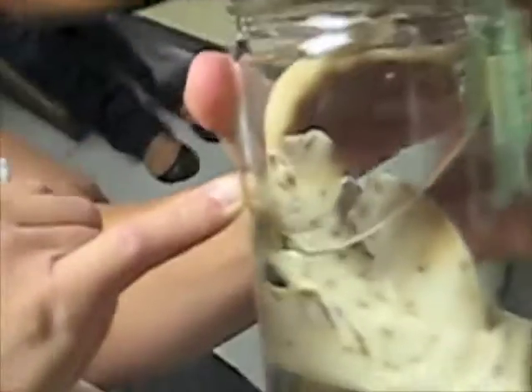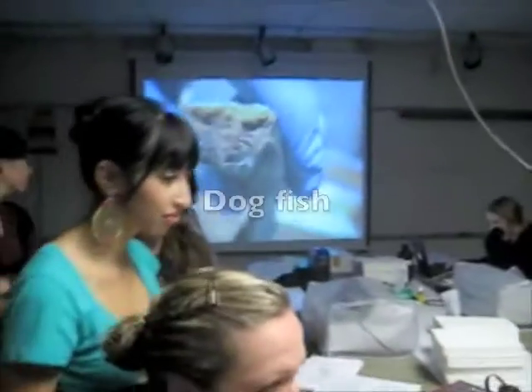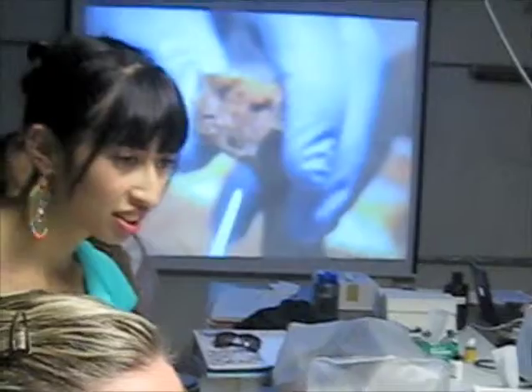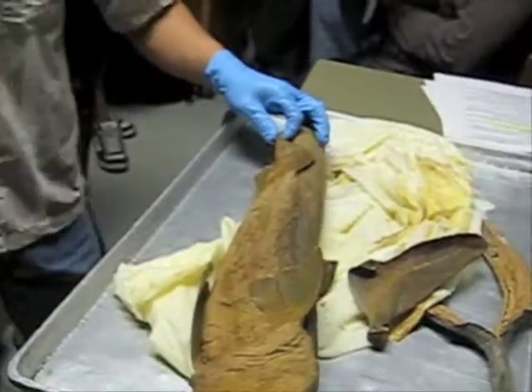This is a little clasper right here. Here we go, cameraman. I know, right? All right, that's a little clasper right there. Yeah, we'll talk about this when we're in class. I'll draw the picture for you guys. We'll draw the arches on there. So this is a male. How do I know it's a male?